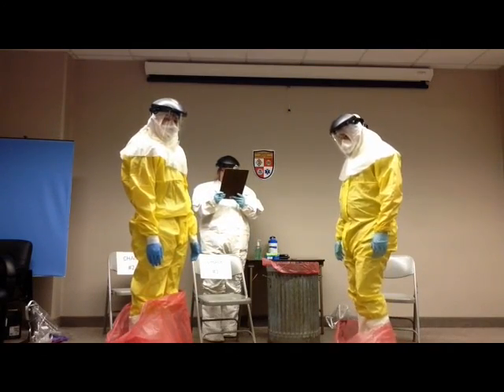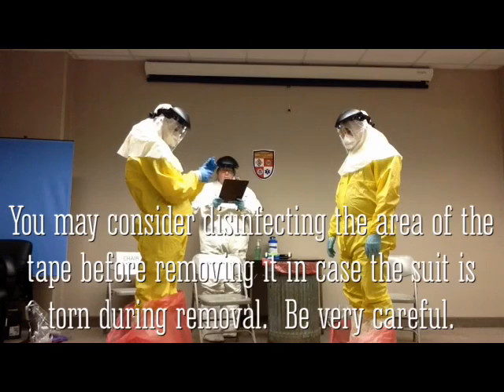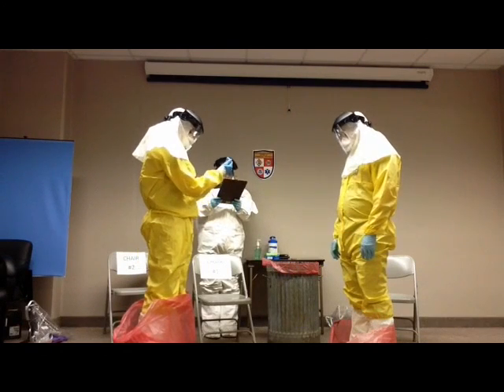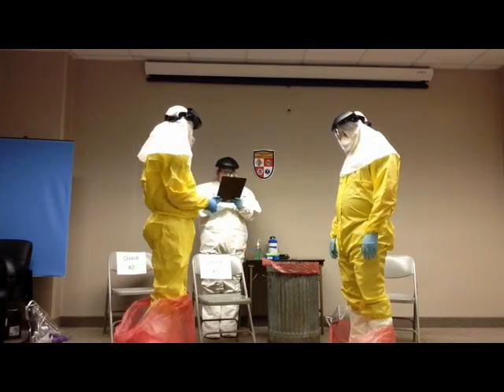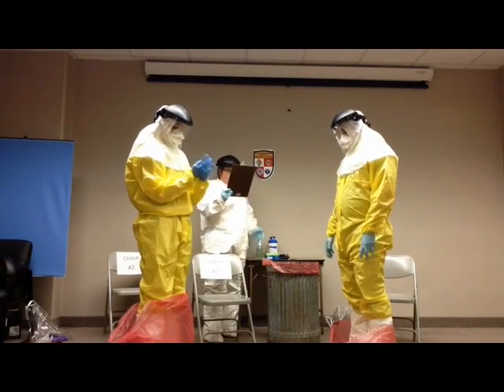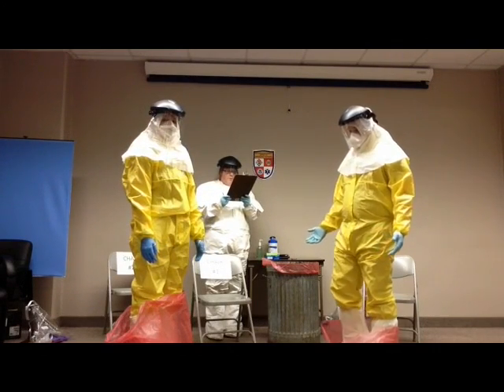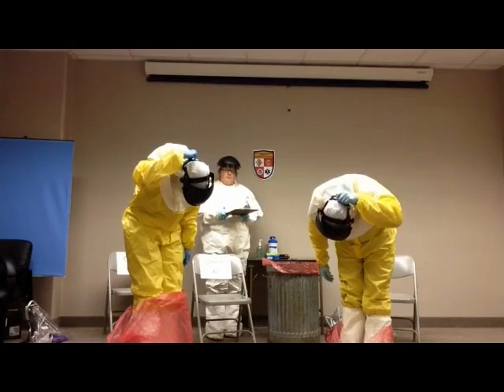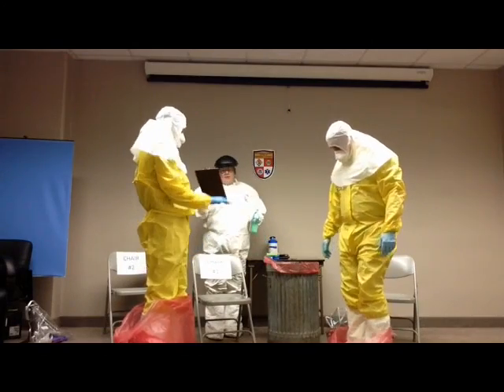If tape was used, slowly and carefully remove tape that is attaching inner glove to the sleeve of the coverall. If tape was used, inspect and disinfect inner gloves. Now remove face shield by tilting head forward and grabbing the rear strap and pulling it overhead without touching front of face shield, and then discard properly. Inspect and disinfect gloves.